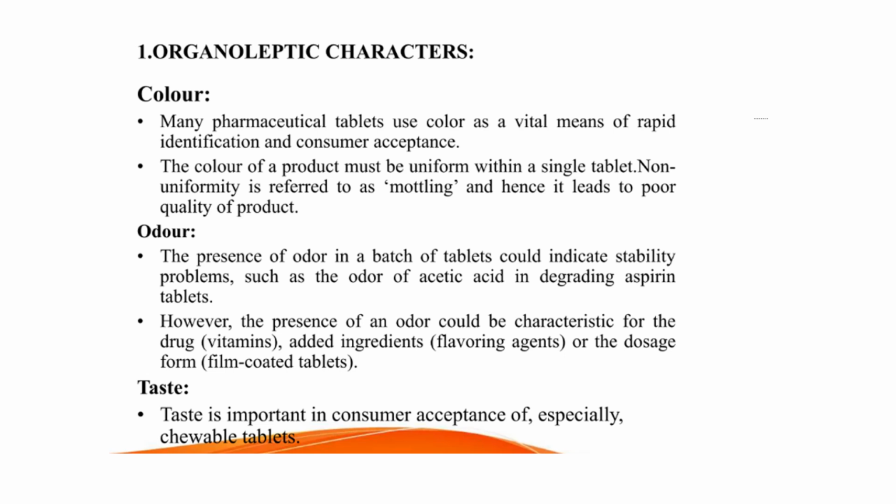Next is odor. Different tablets have different smells. The smell is mainly for consumer acceptance, and also the active ingredient present in the tablet sometimes has some sort of odor. In order to mask that odor, we add some flavoring agents.